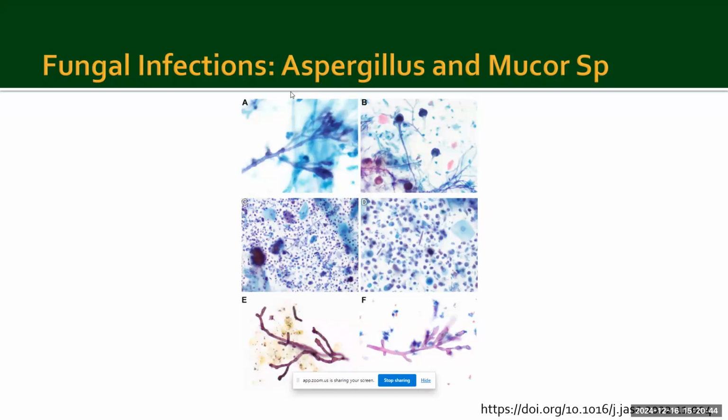since these could be critical diagnosis, especially if the aspergillus is associated with tissue invasion lesion, or if it is a mucormycosis in an immunocompromised patient, I usually treat it as a critical value. I try to contact the clinician in the team. So as a trainee, if you identify this, even when you are screening the sample before you take it up to the attending, it's a good habit to prioritize these cases.